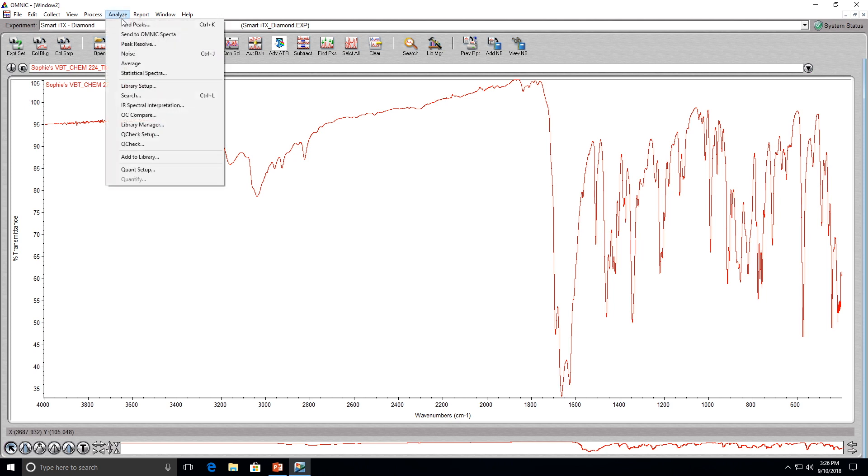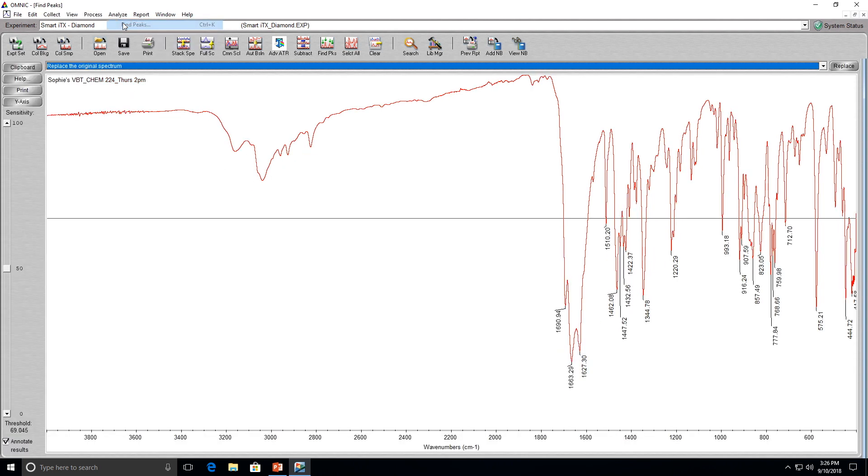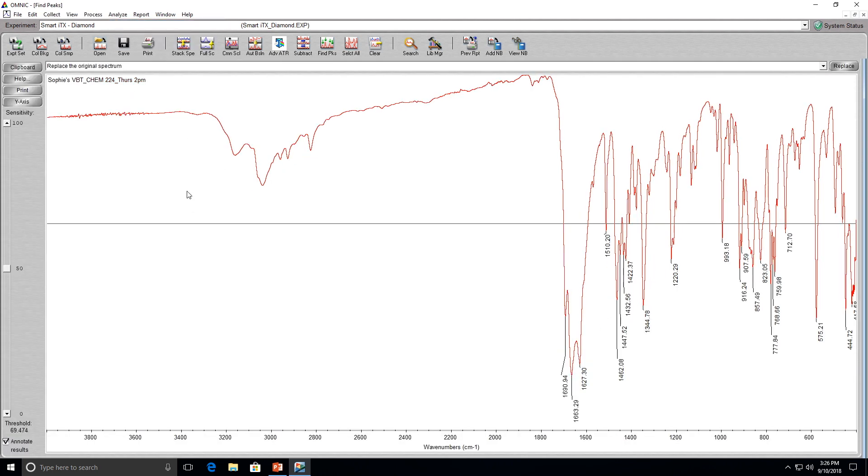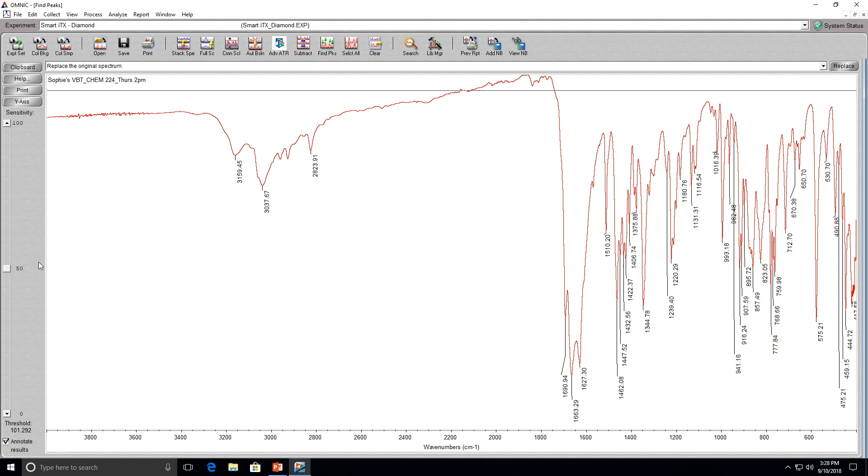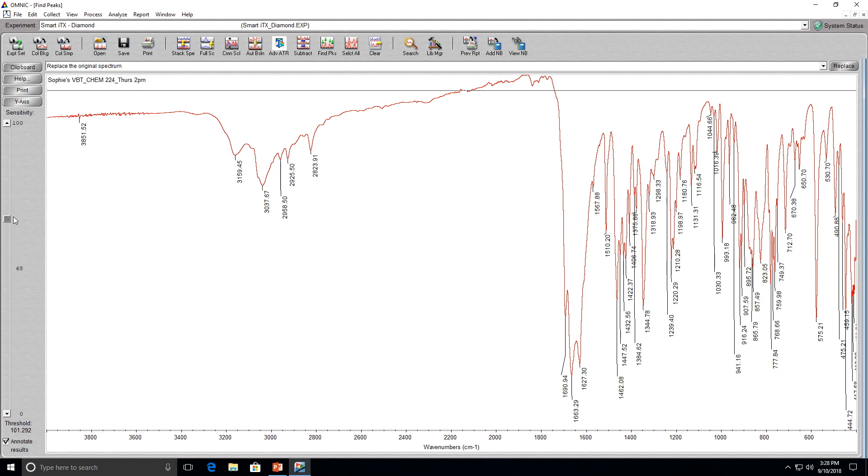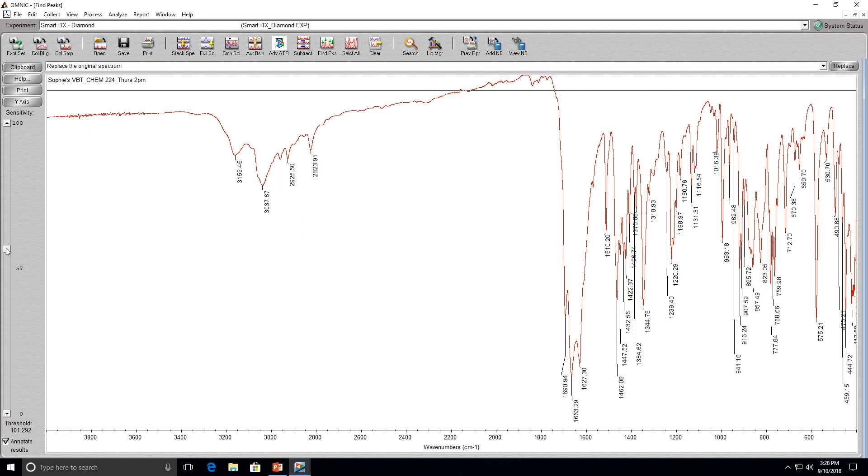Go to the analyze drop-down list and click on find peaks. A horizontal line should appear in the middle of the screen. In order to find peaks and label them for the spectrum, you need to click above the baseline. After that, if there are still some peaks that didn't get labeled, you need to increase the sensitivity of the find peaks tool using the bar on the left-hand side. Once all of your desired peaks are labeled, click the replace button on the top right hand corner.